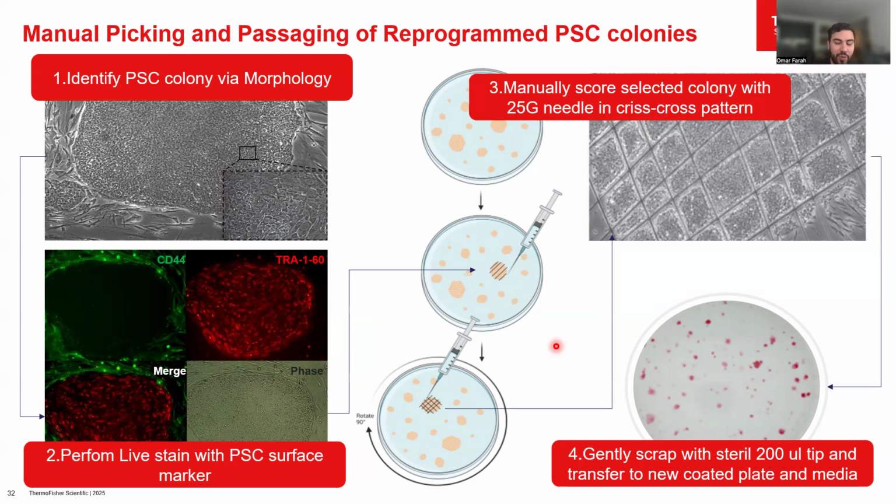And this is primarily why researchers like myself back in the day would use these needles, because we would have a lot more control over where we were cutting or scoring, and we wouldn't want, for example, these types of cells, right? So I would only make squares on the cells that I want to lift specifically.